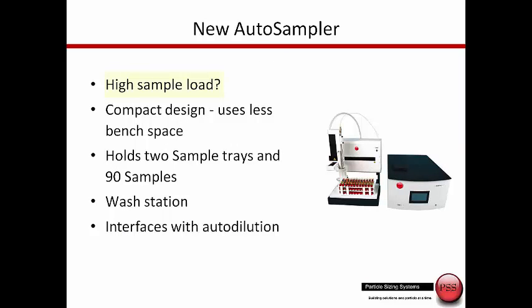We can also measure many samples if you have high sample throughput. The autosampler can measure up to 90 samples loaded in a tray, program the system, walk away and get all of the results.